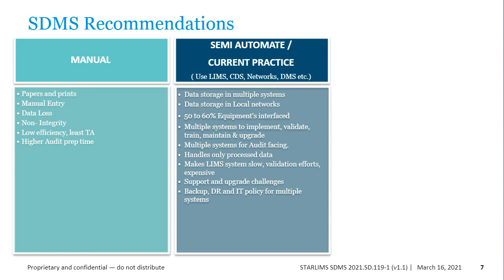And we still have multiple systems to implement and validate, be it a simple IQ/OQ validation or a very serious CSV, computer system validation, of multiple systems, and train the end users on multiple systems and maintain and upgrade them on a regular basis. So that's still a major challenge with the current practices.